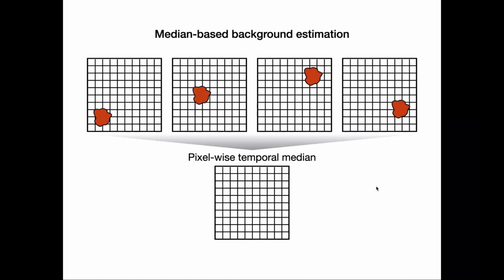And we can also not take median periods arbitrarily long, because at some point we also run into the trouble of sample drift, and then my lattice doesn't stay where it is, basically.